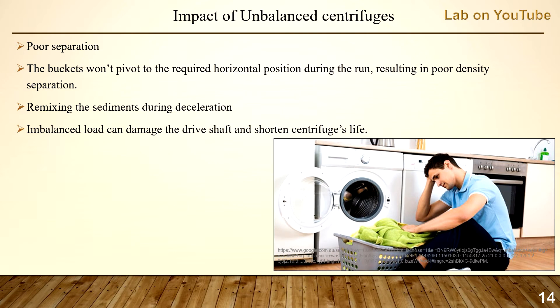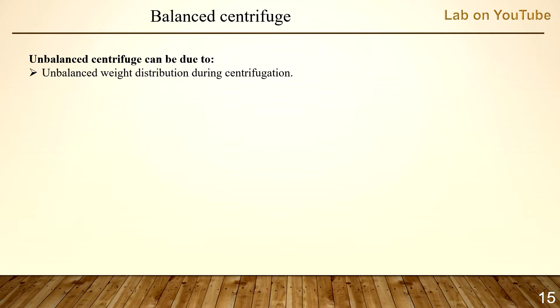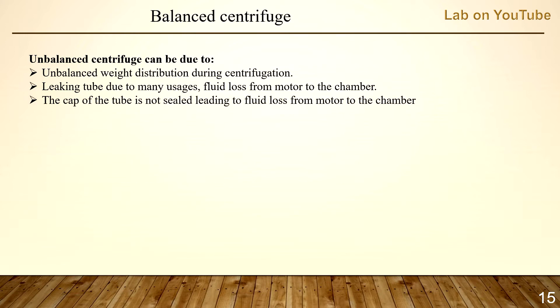By the way, the same principle applies to your washing machine — if it stands on an uneven floor, it will damage the drive shaft and become noisy and shaky during spinning. An unbalanced centrifuge can be due to uneven weight distribution, leaking tubes from many uses, fluid loss from the motor to the chamber, or a cap that is not sealed.